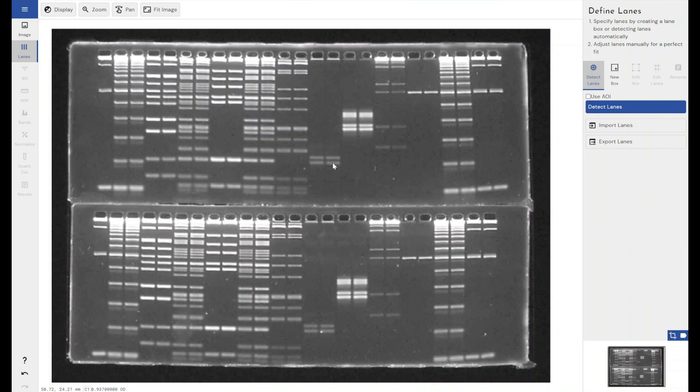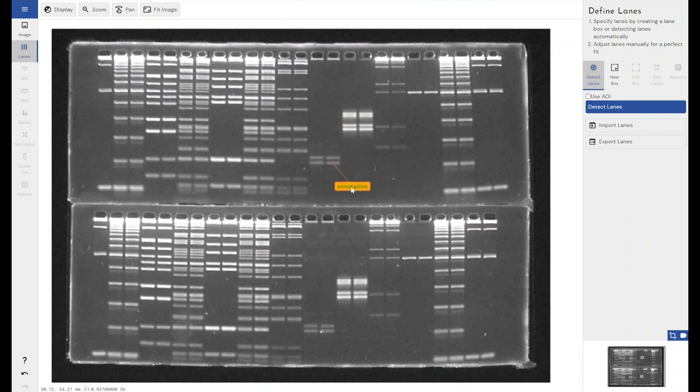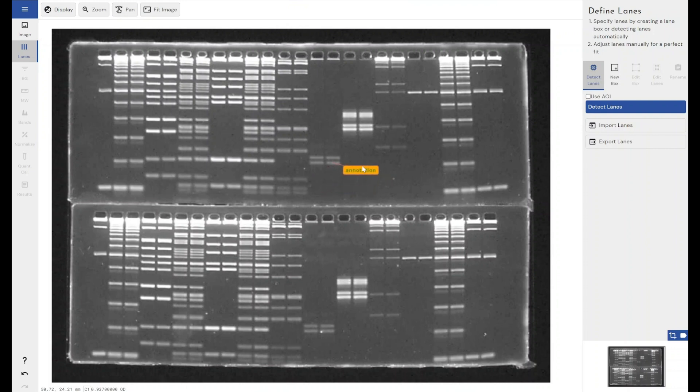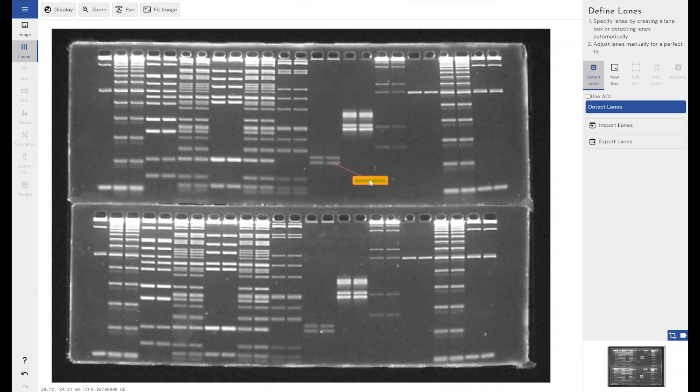Say I wanted to add an annotation about this band here. It's unexpected, it's really interesting, it requires further investigation, something like that. If I just hold my control key and left click, I can then start dragging out an annotation. You can see that the tail end of the annotation is where I started my left click, and I can drag around this comment box within my image to wherever I want it to go.